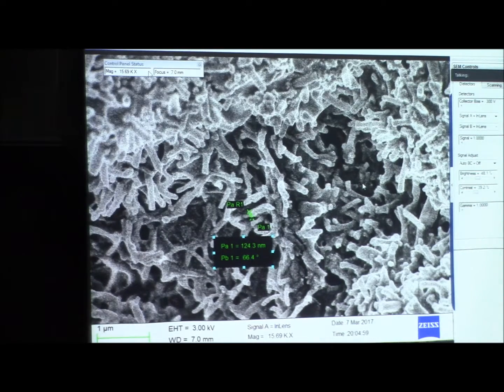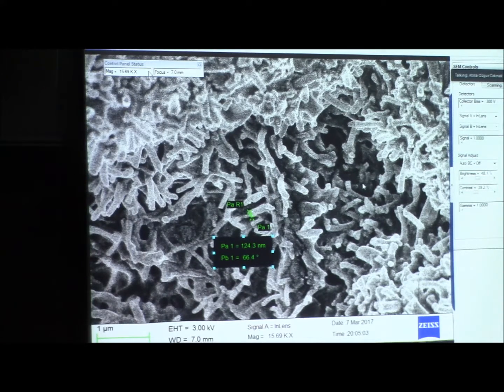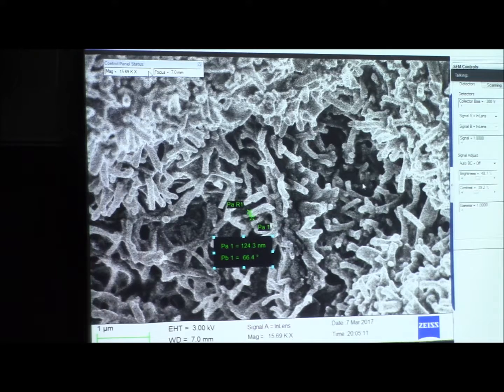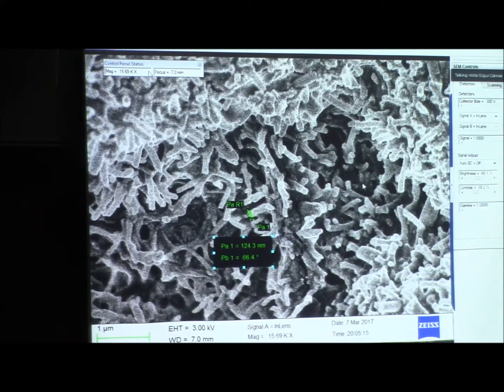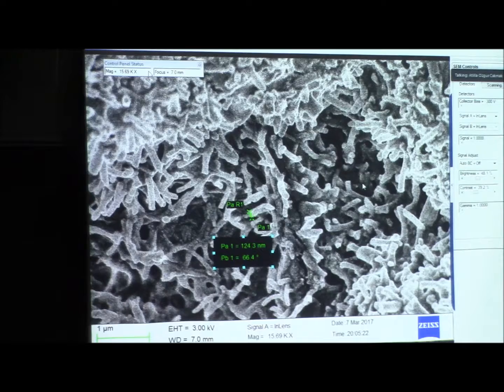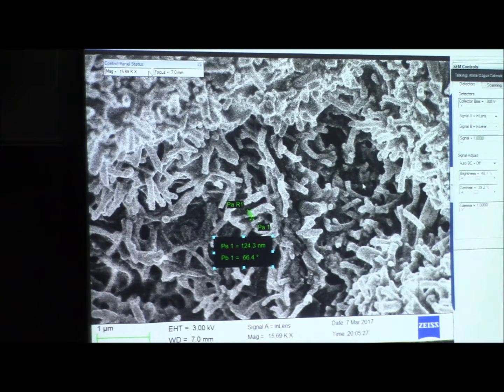Does it make sense? Yes. Do you have any questions? Yeah, Mr. Pena. I have one question. Are these particles made of fiber or protein, or what is this actually? This is a wax actually. This is some kind of wax that is hydrophobic by itself. It doesn't absorb water, but the roughness enhances the hydrophobicity a lot.